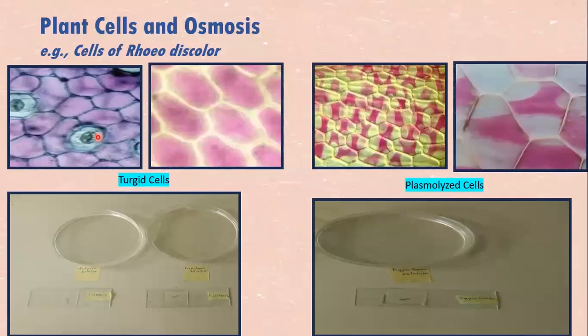We'll talk about them another time, but those are the epidermal cells in isotonic or hypotonic solution, turgid cells. These are epidermal cells in hypertonic solution, plasmolysed. See, plasmolysed cells. Well, we are now going to discuss the process that led to these turgid or plasmolysed cells.